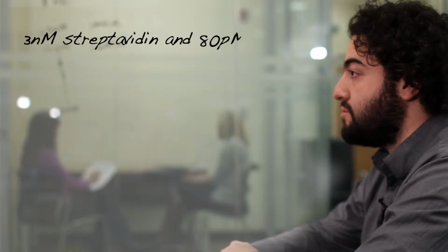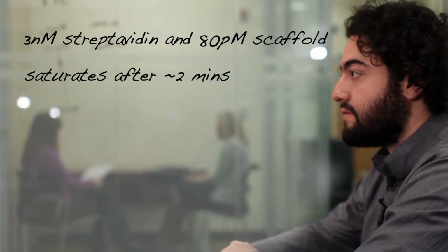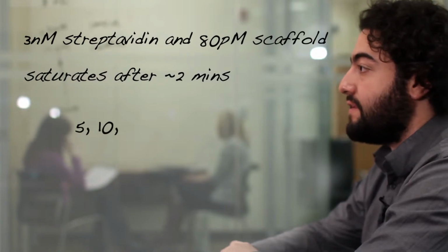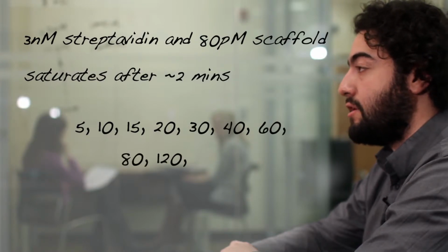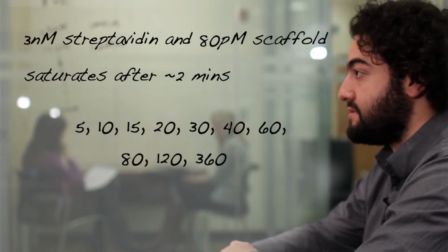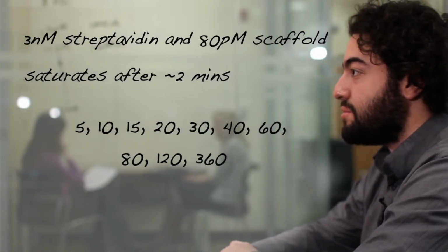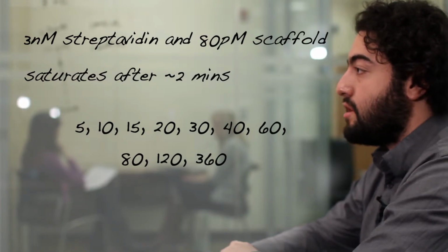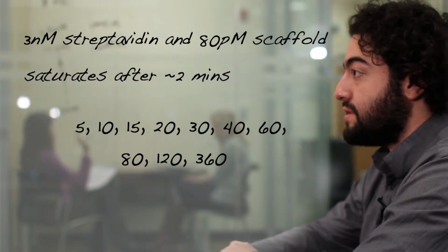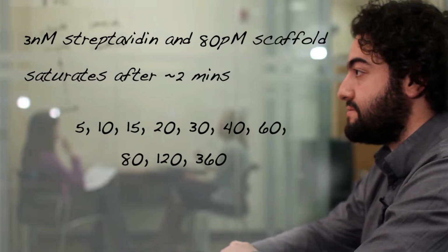The rate of loop closure with 3 nanomolar streptavidin and 80 picomolar scaffold saturates after roughly 2 minutes. A good series of time points to cover this range well in seconds is 5, 10, 15, 20, 30, 40, 60, 80, 120, and 360 seconds. As you will only have 5 seconds between the first couple of time points, you will want to prepare all of your tubes and quenchers before starting the experiment. We will provide a very detailed approach to doing these experiments, which we have found greatly facilitates performing on-rate measurements.